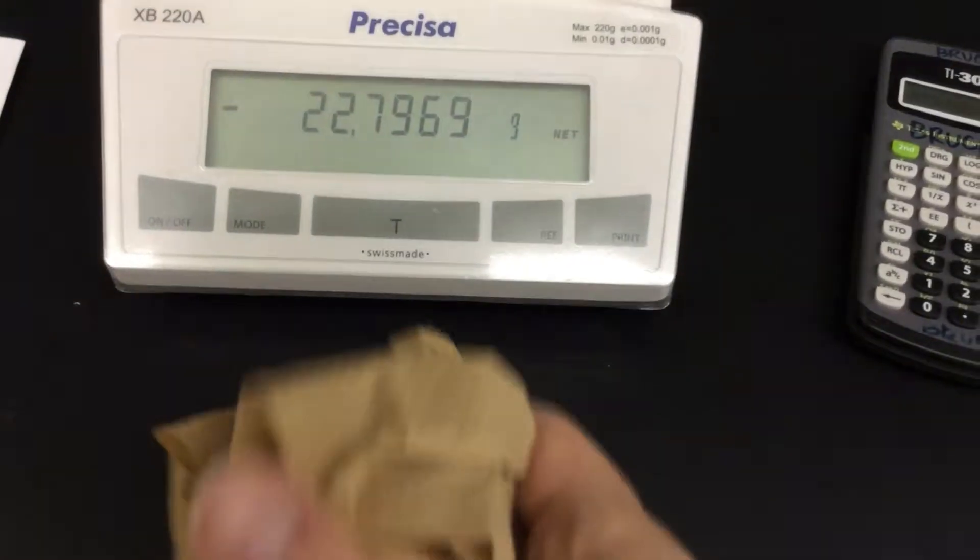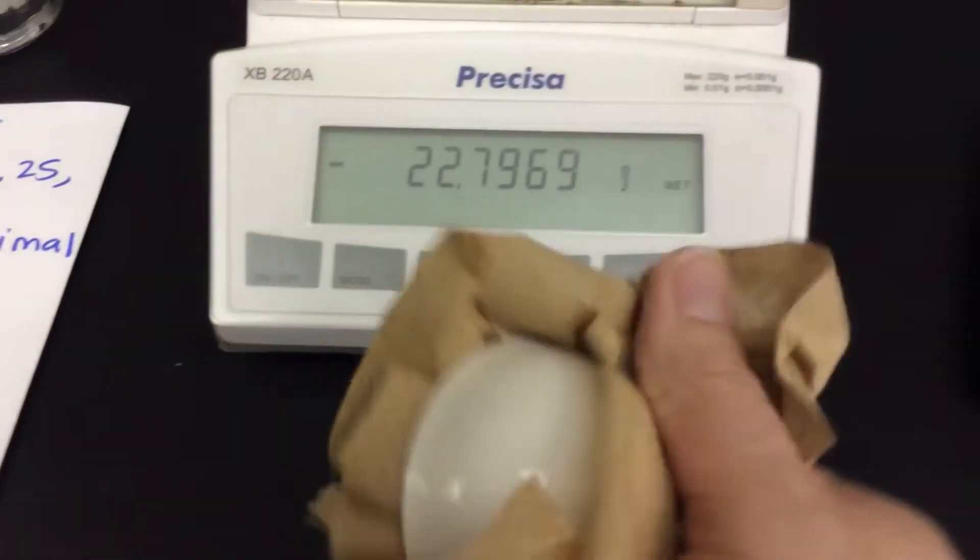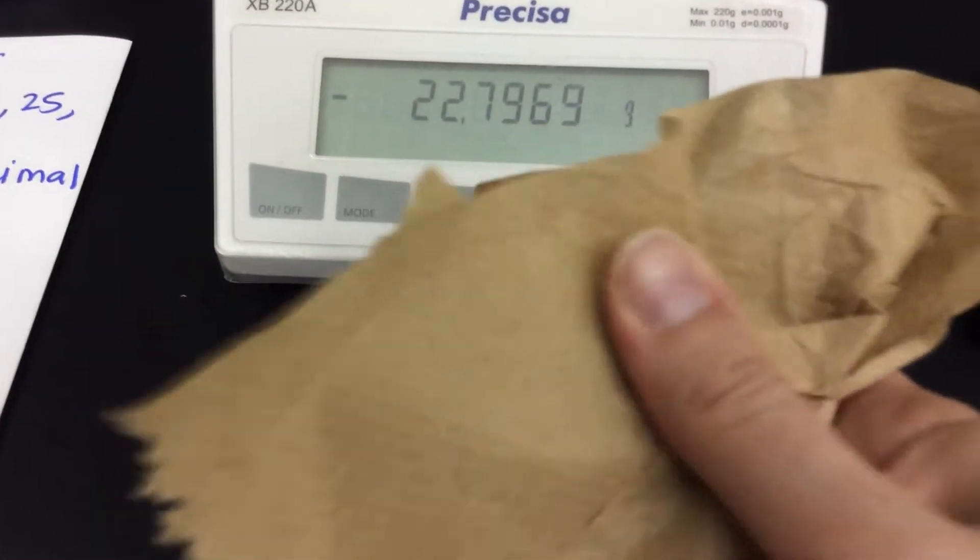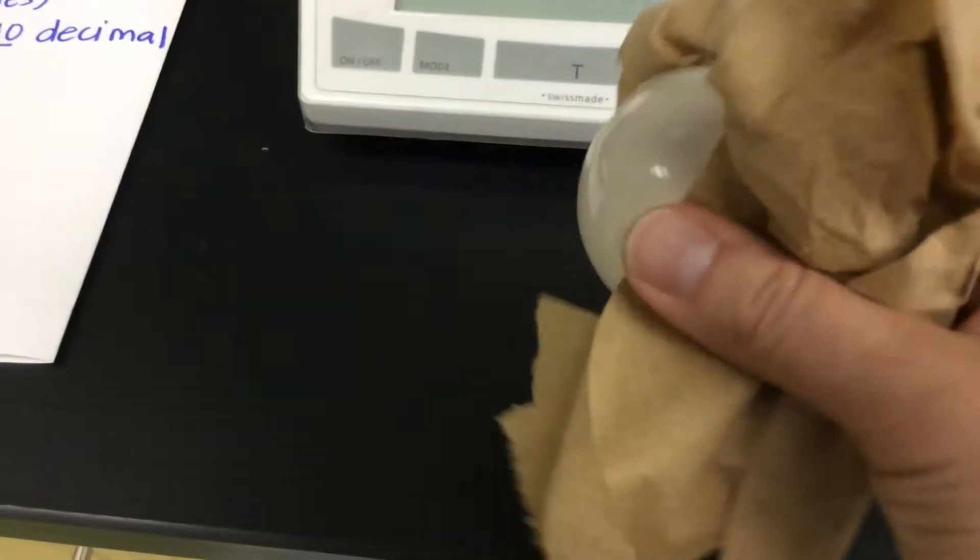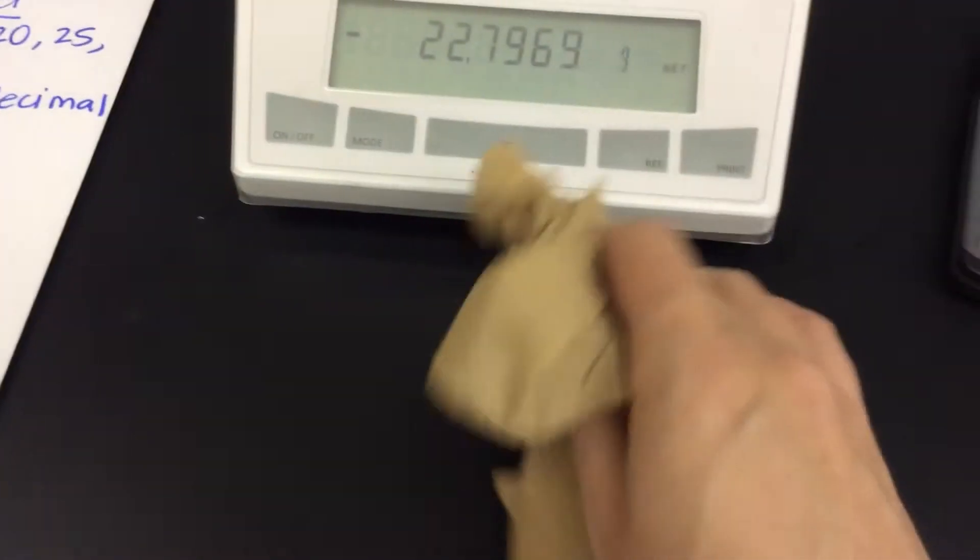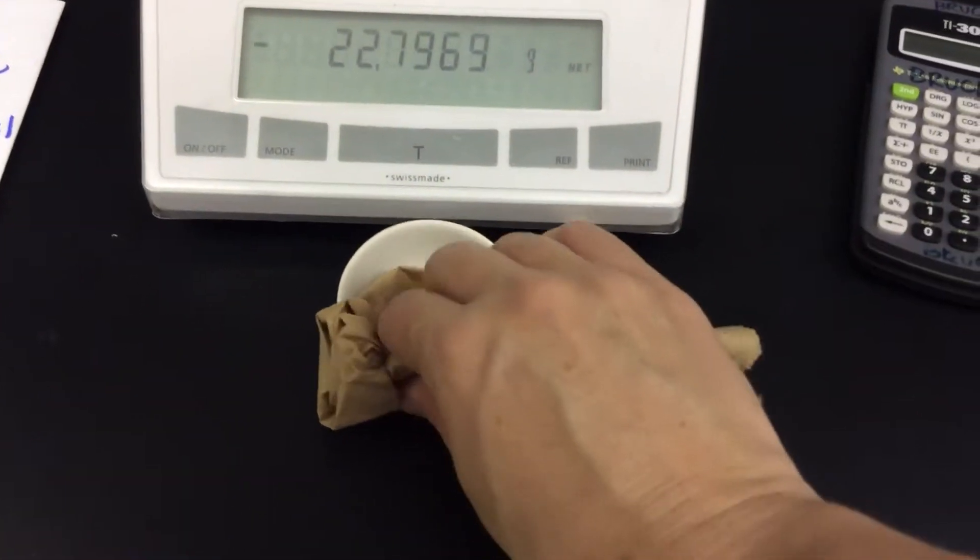So we dry it out really nicely. We ignore anything that this says, right? Because we tared it when there was something on it. There's nothing on it currently. So that means we just ignore anything because obviously you can't have a negative mass. Nice and dry. So that was trial one.